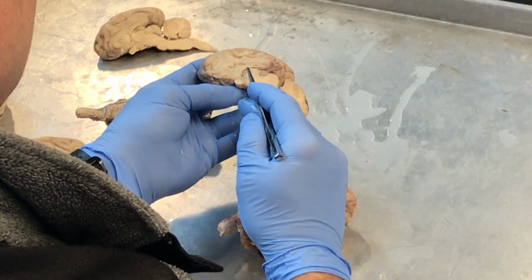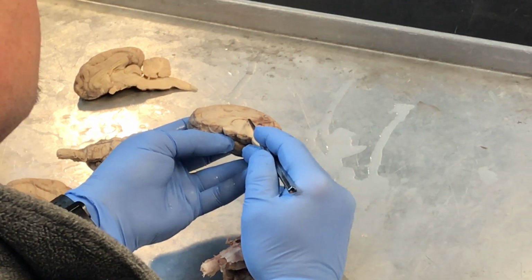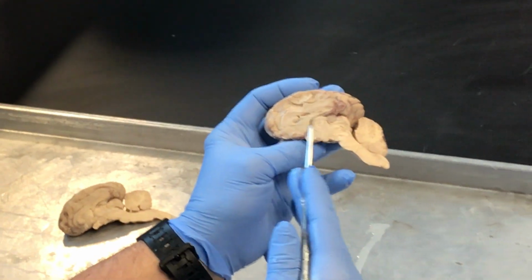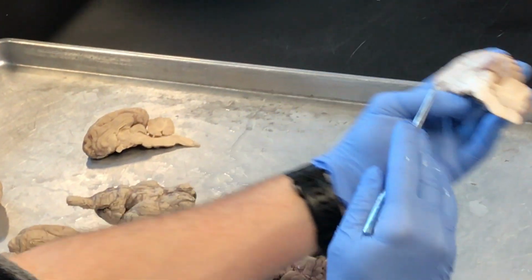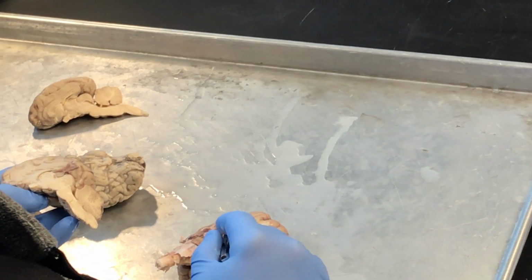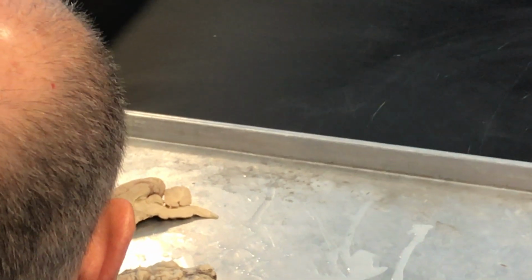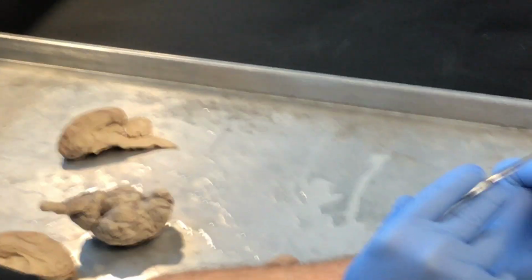See this circular region right here? Can you all see that circular region? Okay, Christina, you see that? This is what we call the intermediate mass of the thalamus. The circle down below is the optic chiasm. We cut through the middle of the brain, so the optic chiasm is where the optic nerve crosses. Are we good? Optic chiasm. Okay? Intermediate mass of the thalamus, optic chiasm.